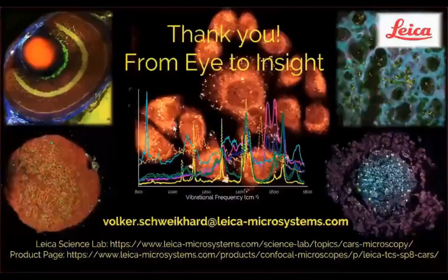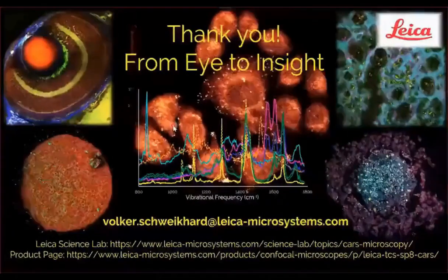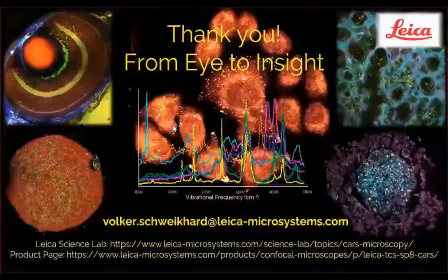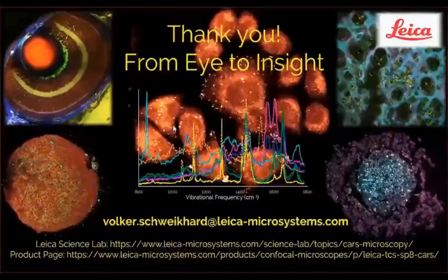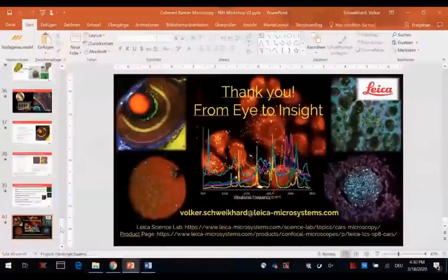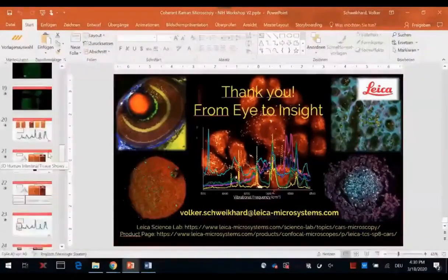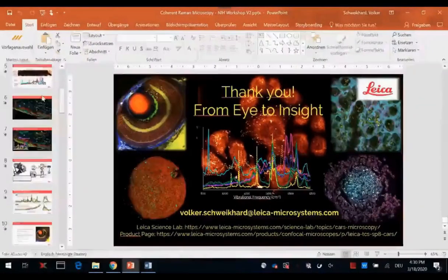This next question is two parts. How are the Raman spectra taken, and how long does it take to generate a spectrum? Let me return to the slide that explains this.